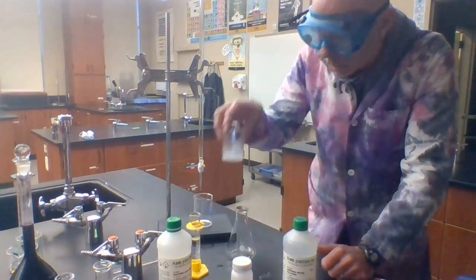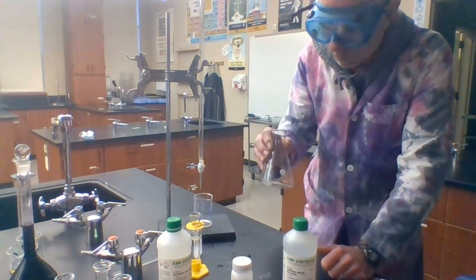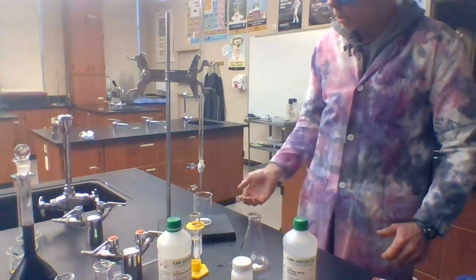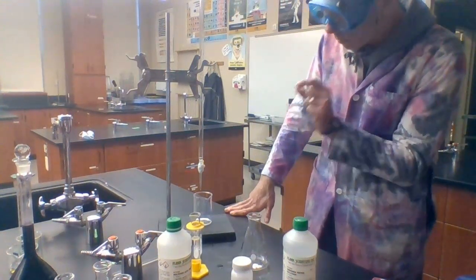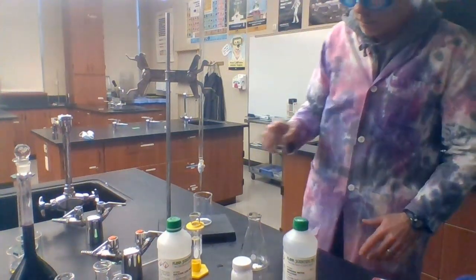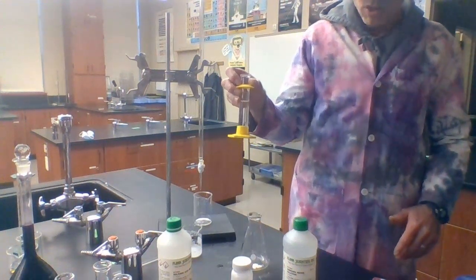I already have the phenolphthalein dissolved in some water here. This is an Erlenmeyer flask. This is my waste beaker here. This fancy device is a burette, which is used typically for titrations or to dispense very accurate volumes of solutions. I've got a funnel on the top that you can't see, for me to fill from, and I've also got a graduated cylinder here that has been pre-filled with the sulfuric acid.